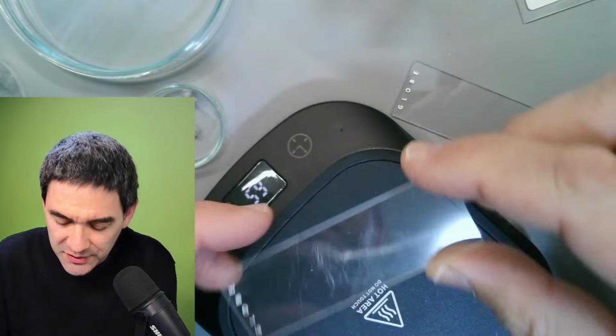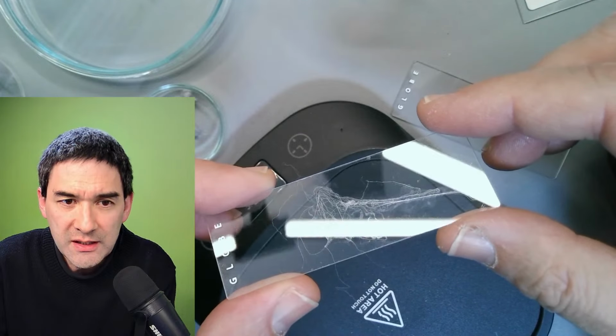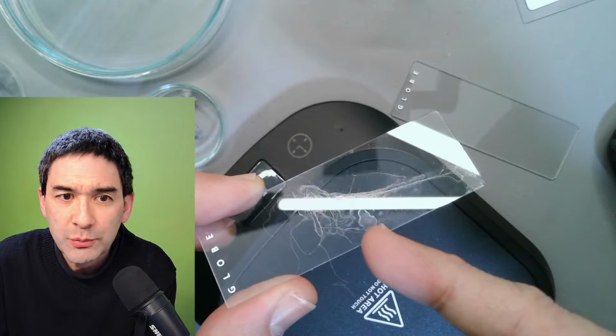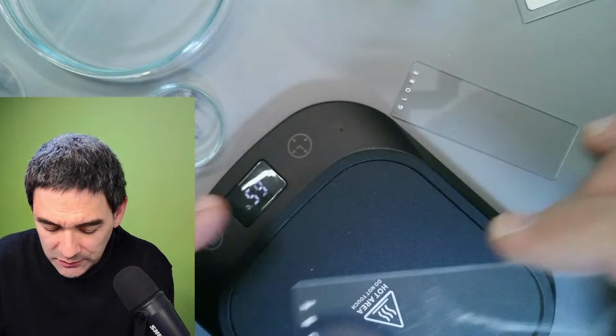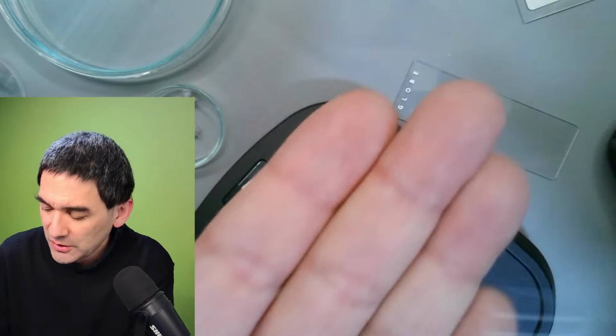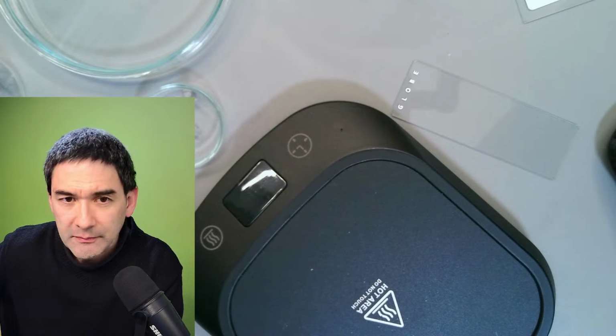Okay, so it's now completely dry, right? But the cotton is flat on the slide. What we can see, however, are those water spots, the calcium carbonate, which we're just going to ignore. Okay, I'm just going to turn this off again. See, it's still kind of hot, so I'm going to put it somewhere on the table to cool it a little bit.